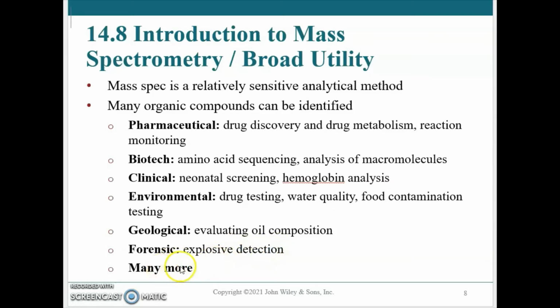But many uses of mass spectrometry. Two to three decades ago, a single mass spectrometer could take up an entire room and require one full-time spectroscopist and a technician to keep it operating. Now, mass spectrometers are routine laboratory instruments that sit on a benchtop and often allow for walk-up use by people that are not mass spectroscopists, routine practicing organic chemists.